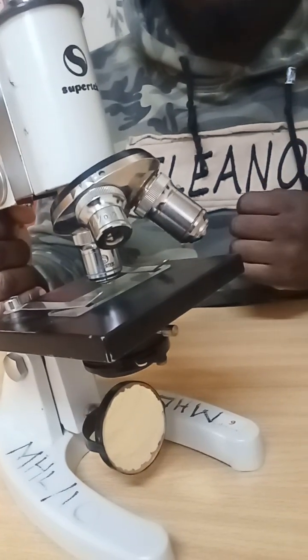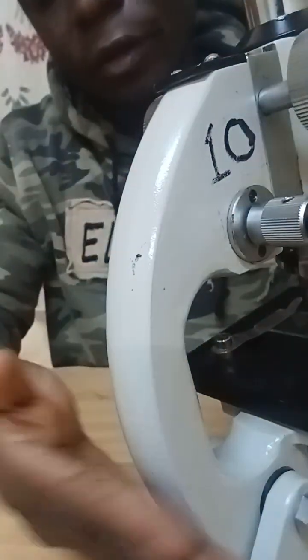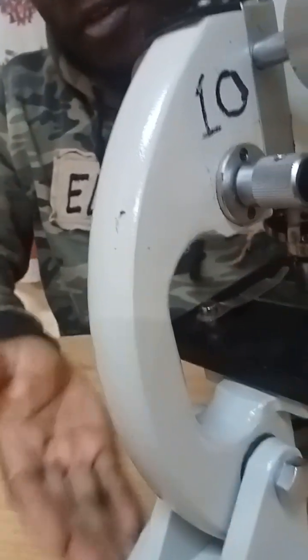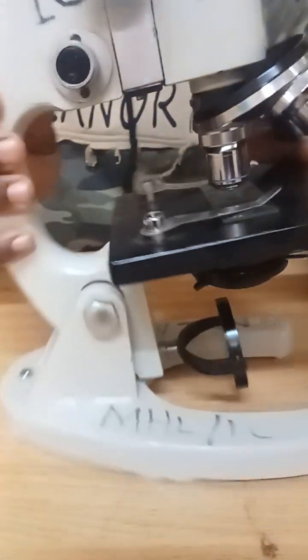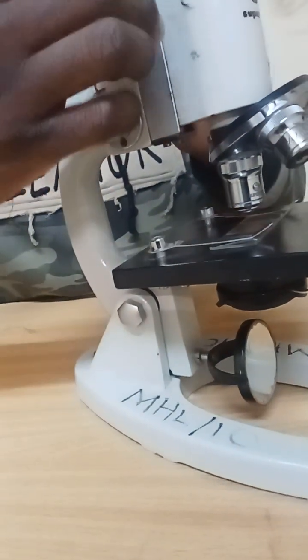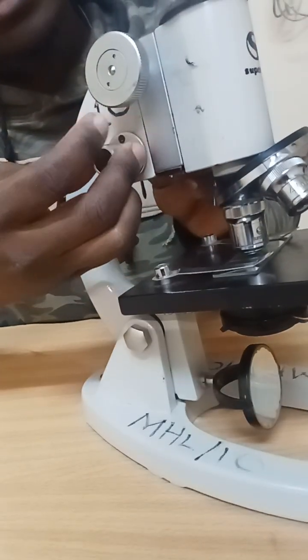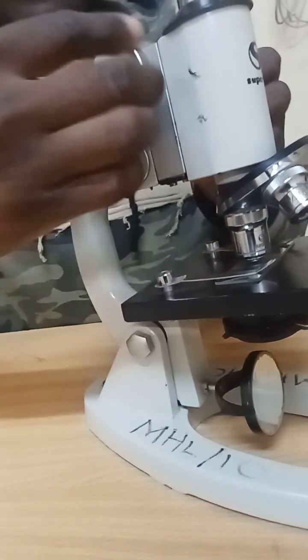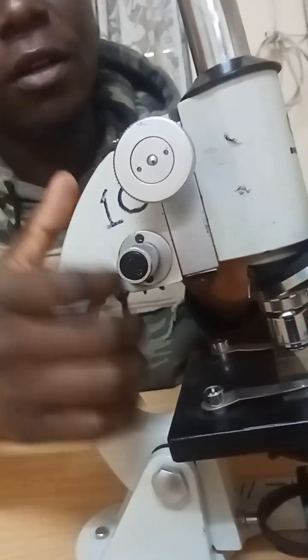Then the next part, we have the arm. As you can see, the arm supports the body tube and the stage. This is the arm. Then at the lower end, we have the base, which provides support. Then you can see knobs. We have two knobs. We have this knob, which is larger, and we have this other one, which is smaller. And this larger knob is what we call the coarse adjustment knob.